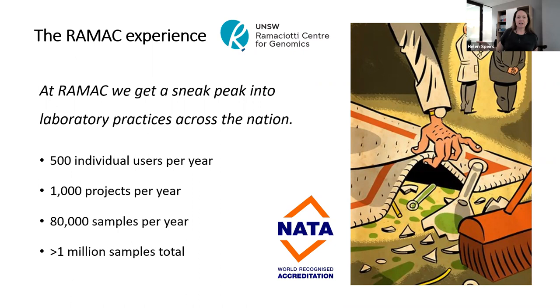So we were deeply suspicious that this was actually the case. So we tested what was in between the wells and it was DNA. So we wrote back to the researcher and said, we're not convinced that it was just the ice leaking in. It probably is DNA that's between your wells. And the response was, please go ahead with the project. This was $80,000 worth of research that was being conducted in admixed samples across all of those plates. So that's just one example of what happens out in the field, essentially.